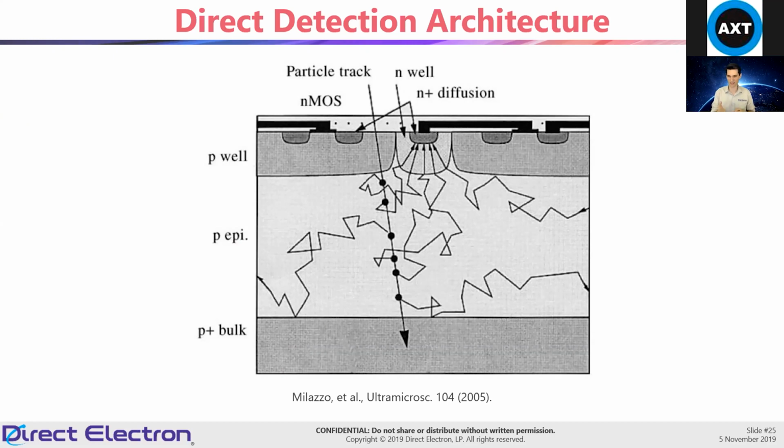They can enter in and either bounce around inside the same pixel, or they can go straight through it without leaving any signal, or they can enter in one pixel, leave signal, and continue on and actually exit out another pixel, leaving even more signal. And so this is the stochastic interactions that all of the sensors have to deal with. And if you have big pixels or small pixels, you can do various things to have better counting or do super resolution, that kind of thing.